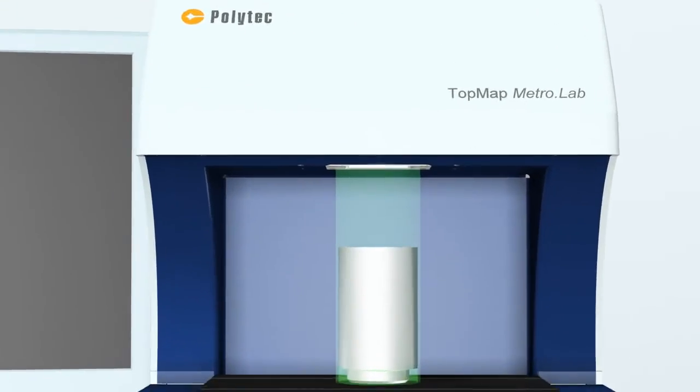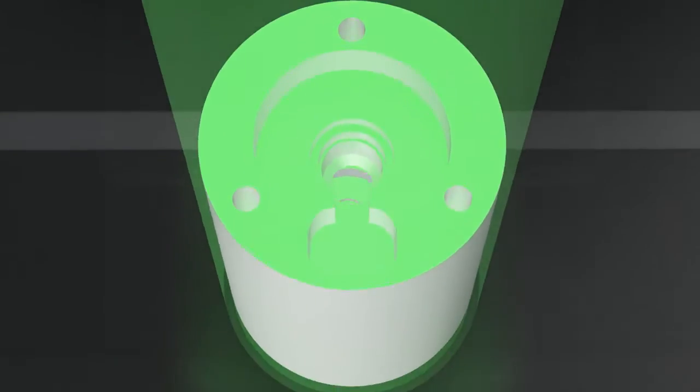The telecentric optical design enables highly repeatable measurements, even inside drill holes up to 70 millimeters deep.